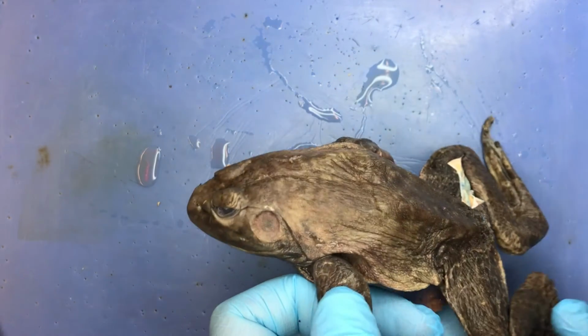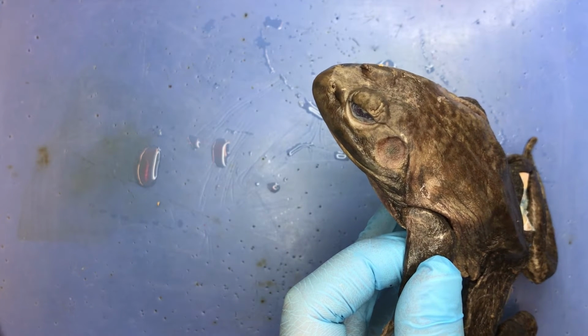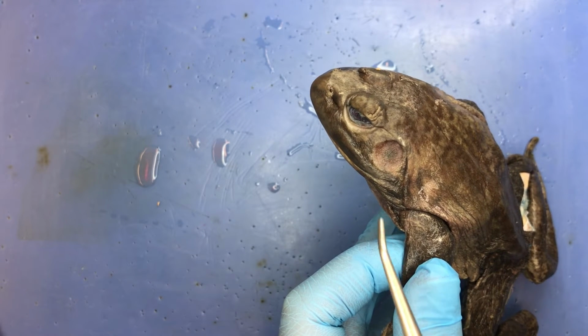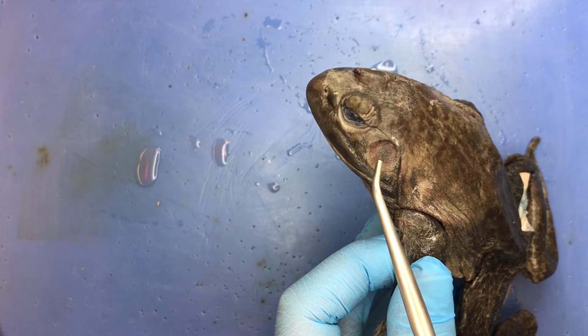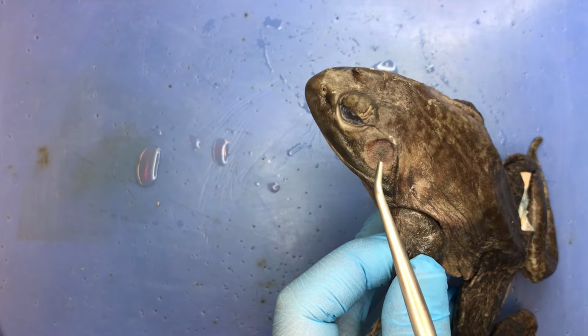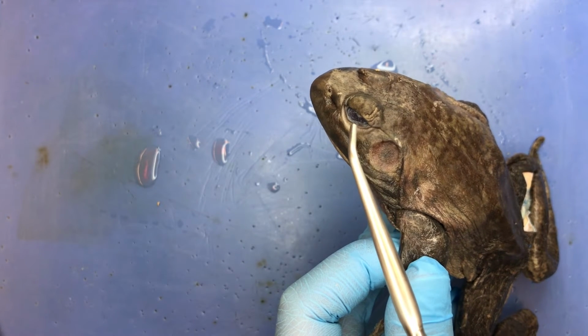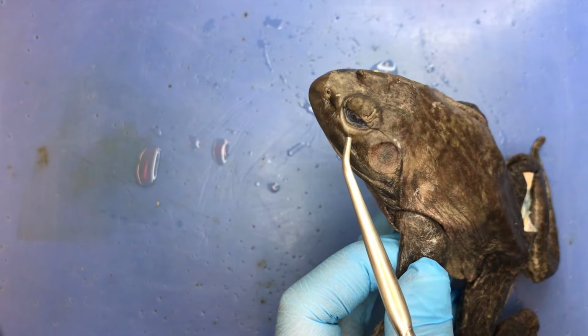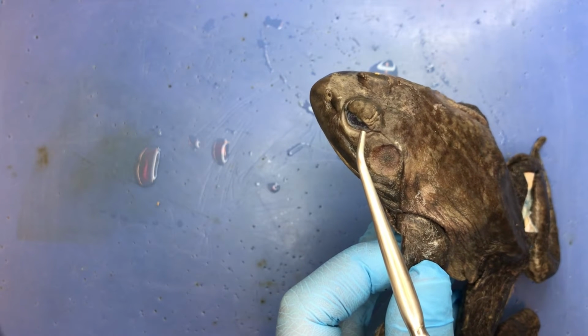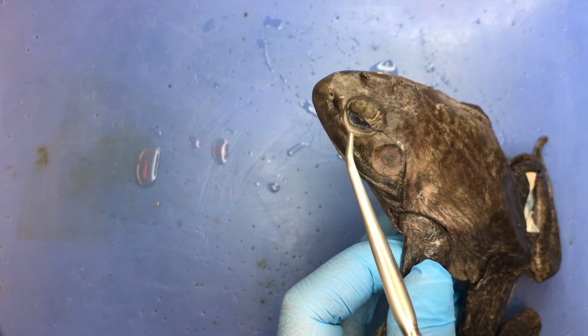Looking at the anterior end of the frog body, we first see conspicuous paired tympanic membranes that extend to the posterior edge of the head region. Just anterior to the tympanic membrane, we see one of 2 paired bulging and large eyes. Each is protected by upper and lower eyelids.